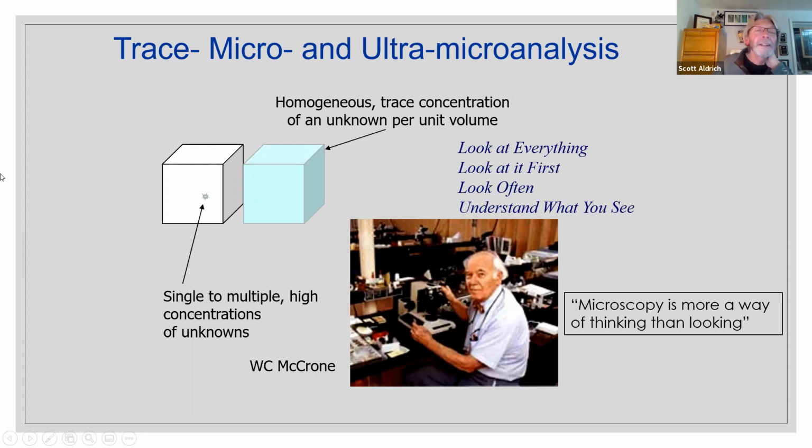And the distinction here is that we're not really using this discipline for trace analysis. We're using it for micro and ultra micro analysis.